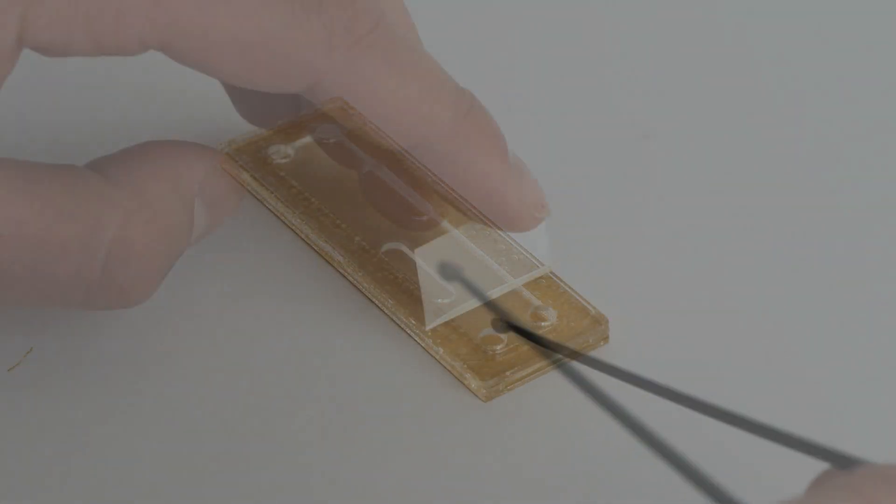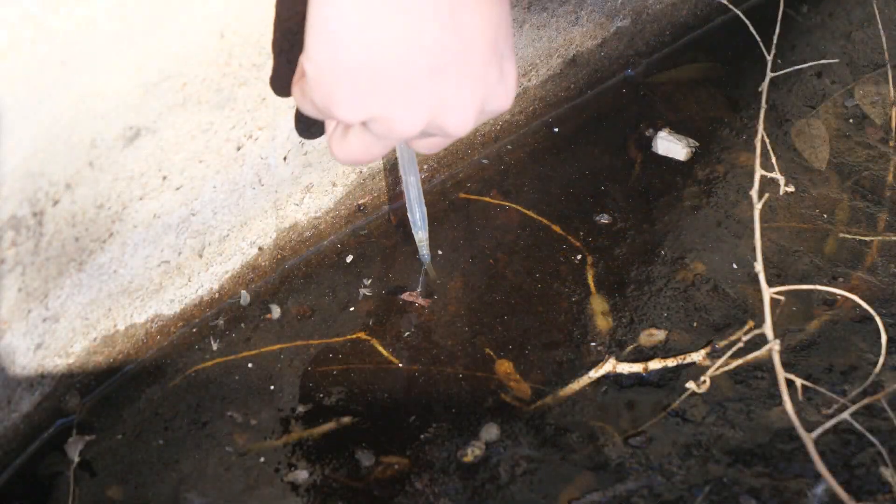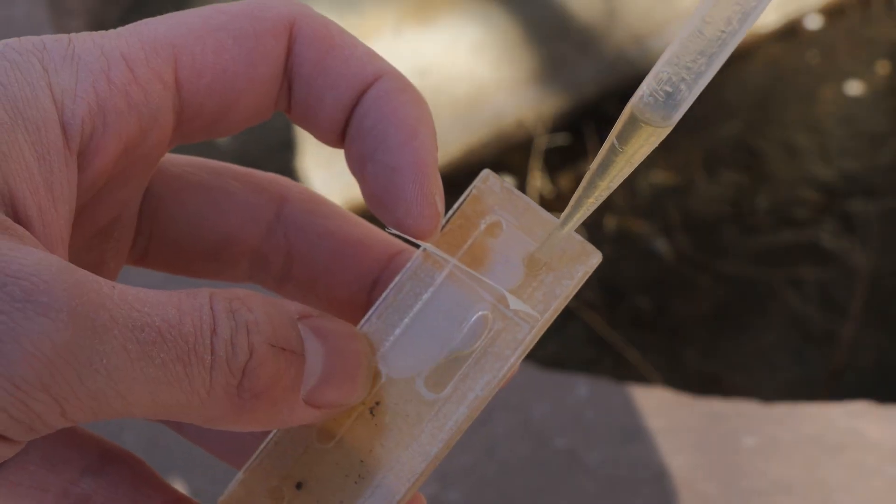Here's how it works. Optionally add in the growth powder, go down to any natural water source, use the included dropper, and whoop to collect your sample. Inject your sample through either filling hole, peel the release liner, and stick down the tape.